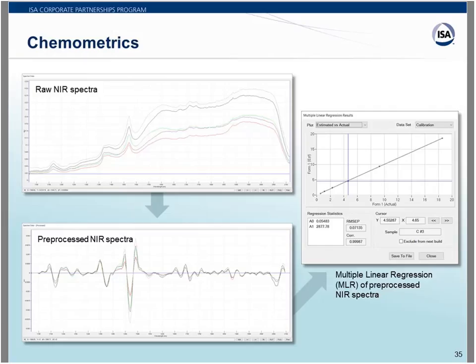The data generated by modern optical spectrometers produce huge quantities of numbers, which requires every spectroscopic scientist to use computers to process the complex spectral information into reasonable and simple results. There are many algorithms available to analyze the spectral data. However, we will not dive into those details since there are various chemometrics software packages available, which really eliminates the task of writing long algorithms to interpret the spectral results.